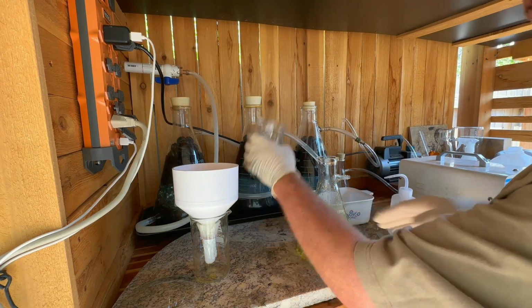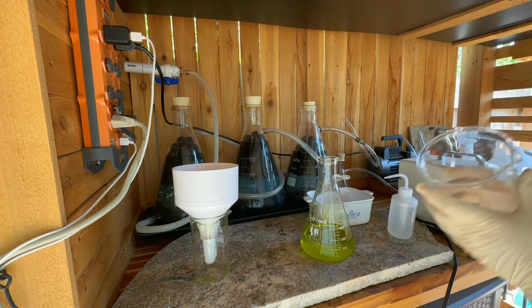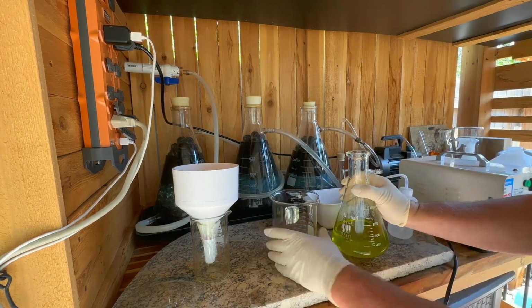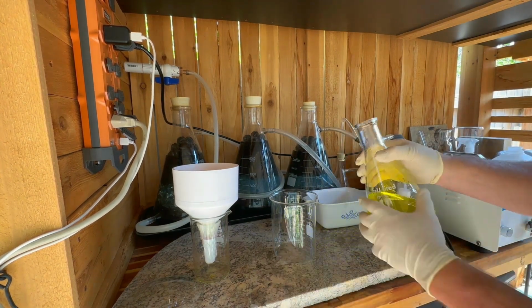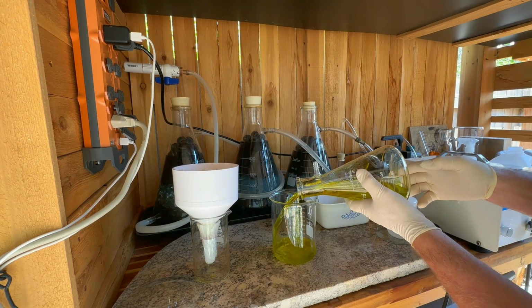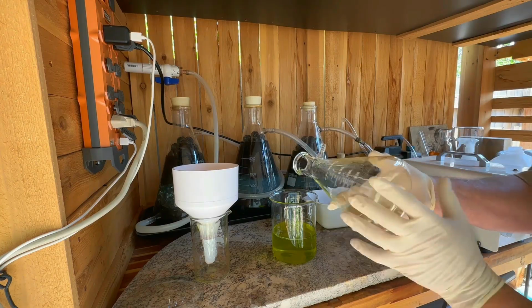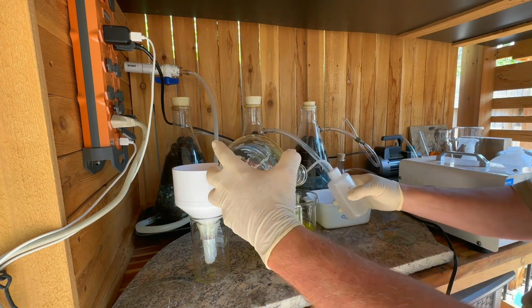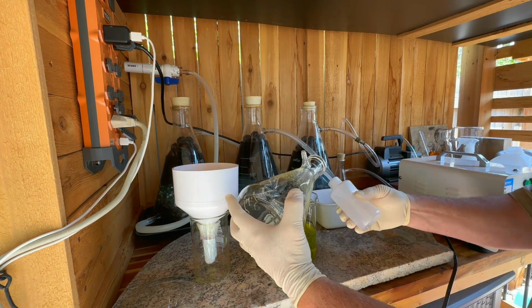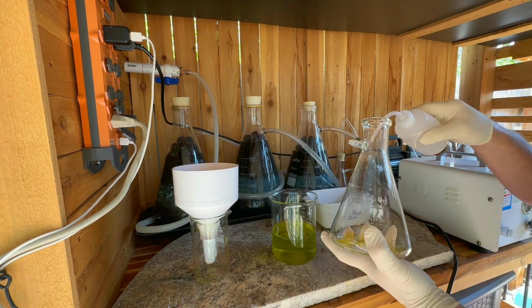I have a little too much solution for these small beakers, so before I make that mistake, get the slightly bigger beaker over here, and we'll go ahead and pour this solution in. I'm not sure if you can really see the little bit of fog. Hopefully you'll see a difference once we put it through the filter again. So I'm going to dump this off, going to clean out our flask, and then we're going to filter it back through that same filter, which is now jammed up with the stuff it took out the first time.